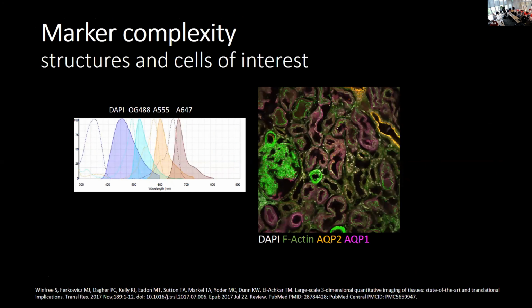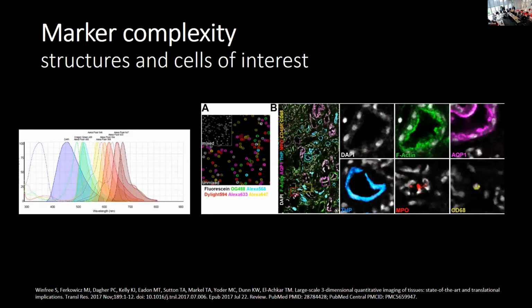So of course, what I've just mentioned here is a 4-channel space, and although that's usually or traditionally the maximum in the confocal world, we have delusions of grandeur and would like to have more channels and more information. We would both like to, for instance, understand structural components as well as infiltrates, so immune cells, for instance. So we've developed a strategy to get us 8 channels into these large 3D volumes. This is, I would say, in the grand scheme of multiplexing, as much as we've attempted, there are other approaches that deal with non-3D structures that allow you to multiplex to 32, 64.